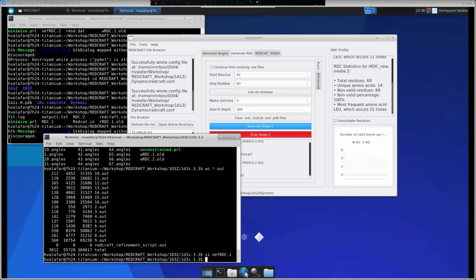Okay. If I use NOEs and dipolar couplings in the way you suggested much earlier in your presentation, could we use just 1 dipolar coupling for the refinement if we started with NOEs?